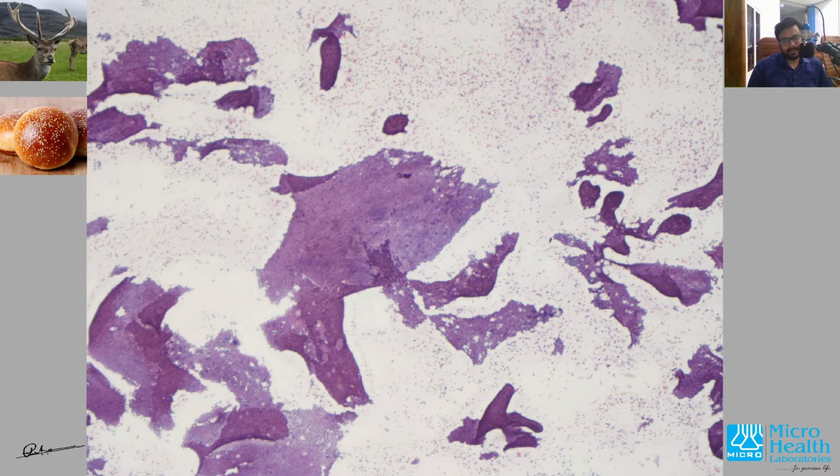But in this case, the age is in the 20s, and the characteristic features of the lump, as told by the surgeon, are that it is very mobile, firm, and not attached to the skin. So we have an assumption, and what we think of first is a fibroadenoma. That is what comes to our mind, and all the descriptions told also fit clinically with a fibroadenoma.